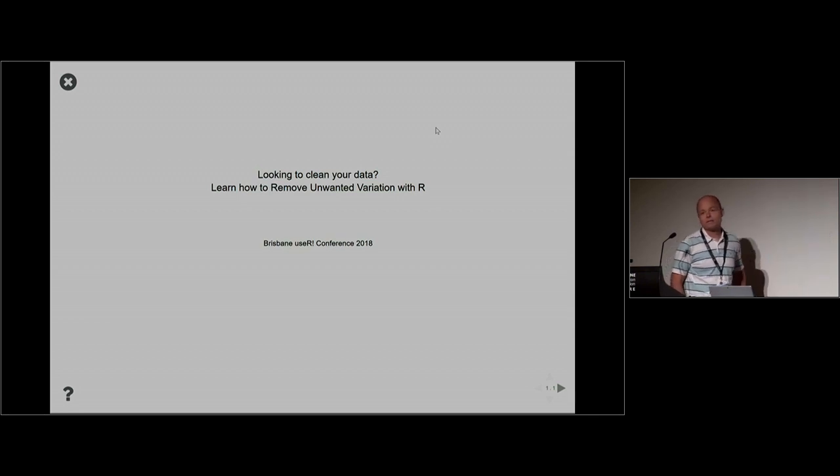Then the second 30 minutes, I'm going to talk a little bit more concretely about the RUV package that's on CRAN. And then during the final half hour, I'll demonstrate a Shiny app. So that's roughly how it's going to go.